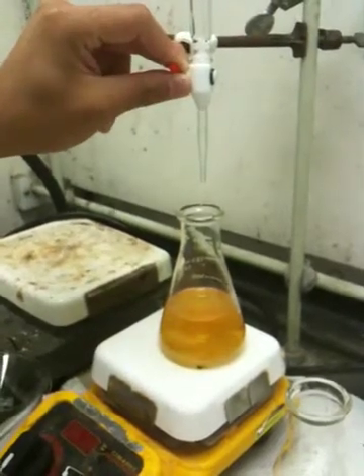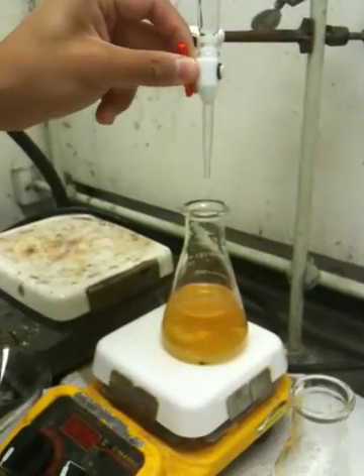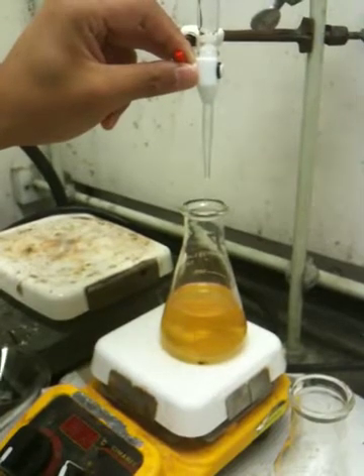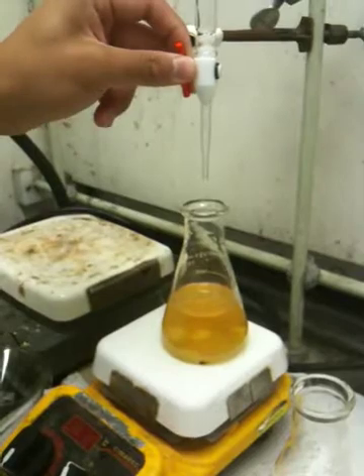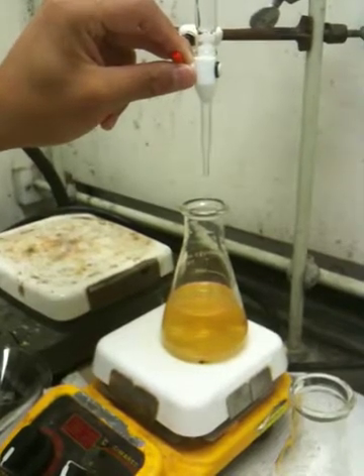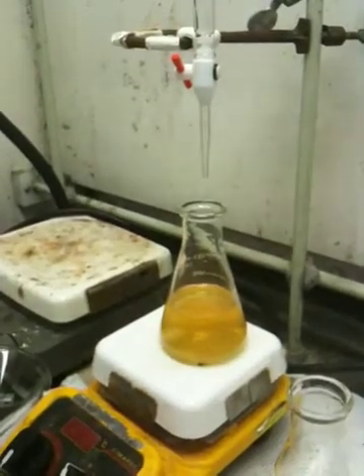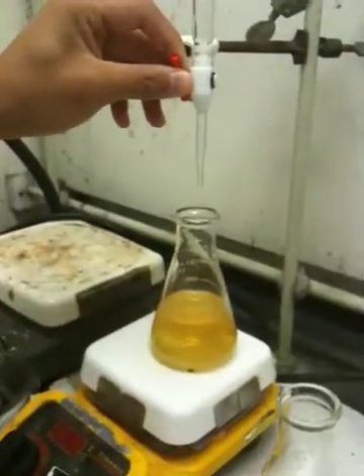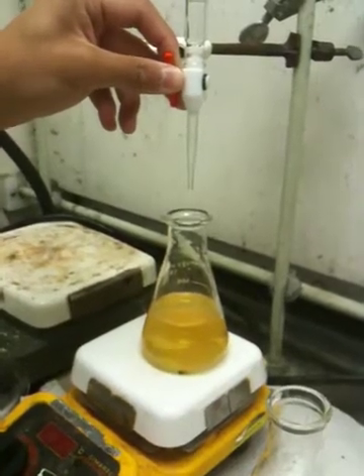Nice and easy. You're good, you're good. Still looking good to me. You got way more to go. It's way too yellow. Let's get in there, a couple more. Yes, yes, yes. Definitely getting there.